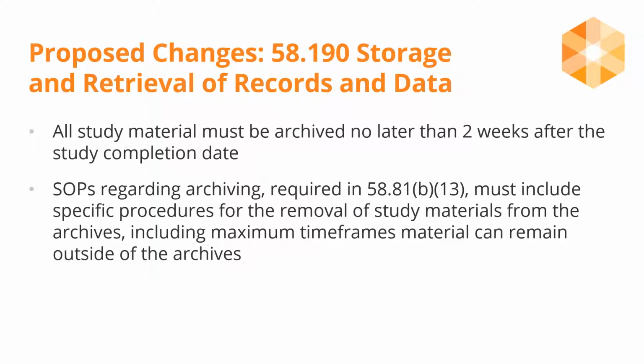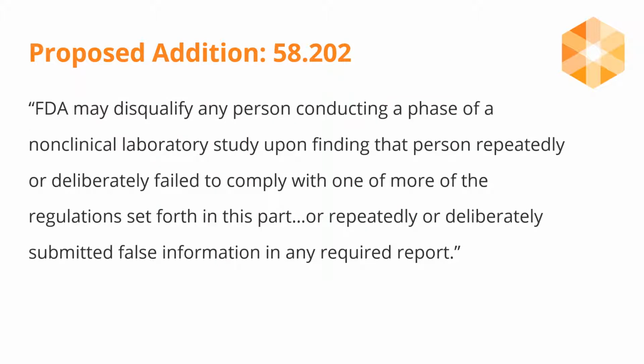As it relates to storage and archival, all study materials must be archived within 2 weeks. Also, SOPs regarding archiving must include specific procedures for the removal of study materials, as well as the maximum time frames that materials can be moved outside of archive. The FDA rules must be adhered to, otherwise the FDA may disqualify any person conducting a phase of a non-clinical laboratory study.